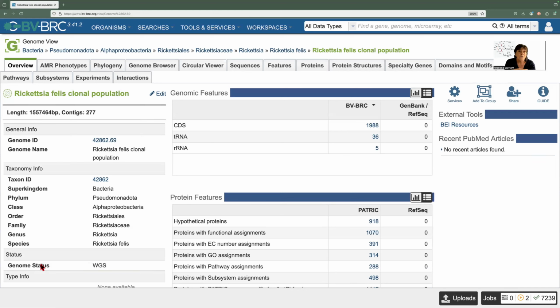Now, next, we're going to look at the viral bins. So I know you're going to want to join me for that because it's very exciting, especially the ones that are coming from this squashed African fly. See you there.